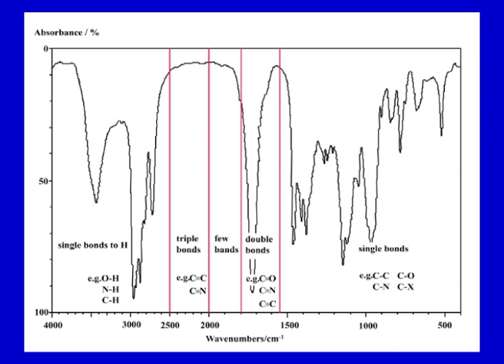The OH and NH stretching frequencies fall in 3700 to 2500 per centimeter, with various intensities. Hydrogen bonding has a significant influence on the peak shape and intensity, so that is also very important. Then the CH stretching bands occur in the region of 3300 to 2800 per centimeter, and we can go on, where different kinds of compounds, like aliphatic, saturated or double bond compounds, have characteristic spectra. Different regions could be taken.